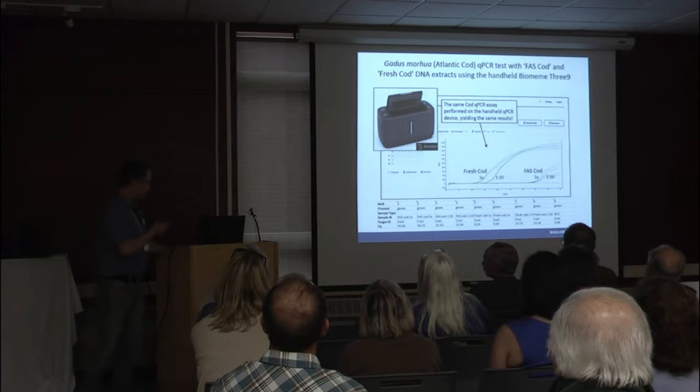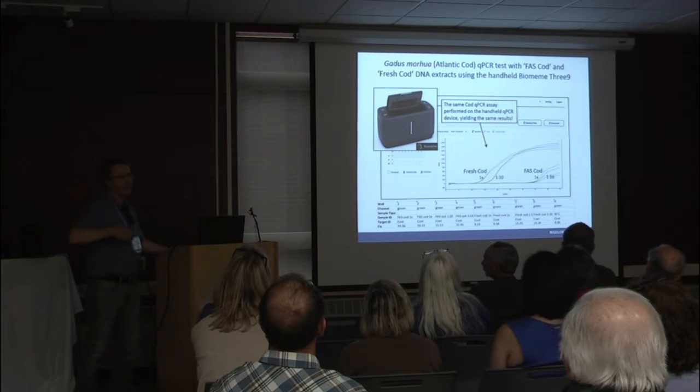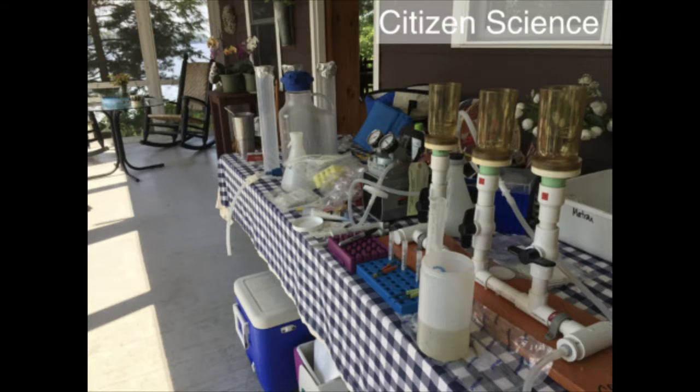This was a little test we did to determine whether it was Atlantic cod or Pacific cod, but it's the only picture I had. So again, this is what I have set up, a little mobile DNA sampling unit. This is on the front porch of our board member's cottage over on Winnipesaukee. We filtered water samples down. We could do a quick DNA extraction.